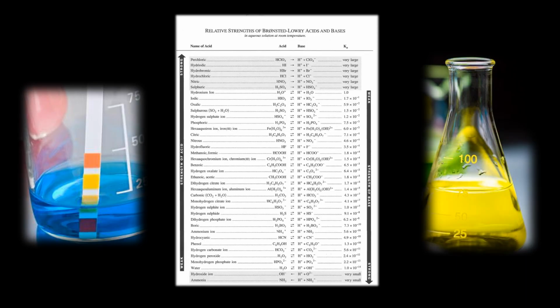There is also one more table for now that needs to be found and downloaded. It is a copy of the relative strengths of the Bronsted-Lowry acids and bases. If you are not able to find and download free copies of these tables, feel free to contact me and I will send you a PDF copy containing these tables and more. They are a must-have going forward.